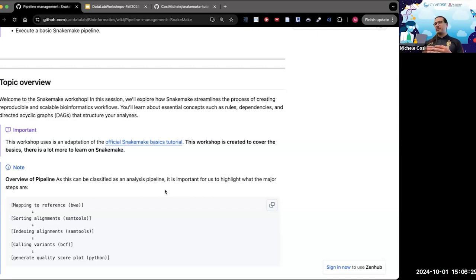And therefore, bioinformatics is one of these fields that requires a way to maintain your pipeline and also help you manage your pipeline itself. We talked about parallelization last week, one of the main strengths of Nextflow. And pipelining and pipeline management allow you to better maintain these pipelines.